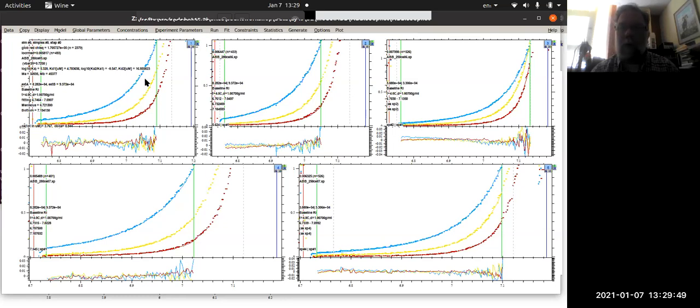If you explore the parameter space with enough different concentrations of A and B, you'll be able to back out the equilibrium constants for this heteroassociation. I like this example because it's fairly complex, but otherwise the data itself just looks like a bunch of exponential curves, right?